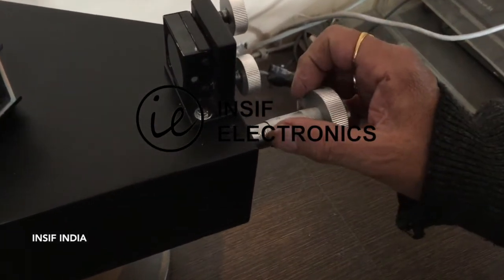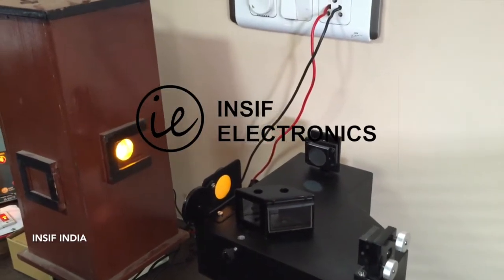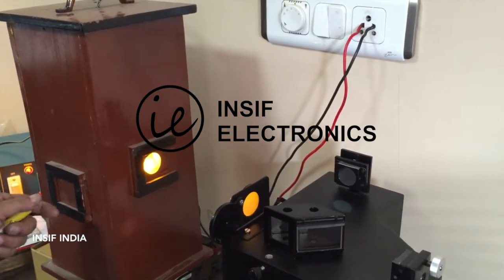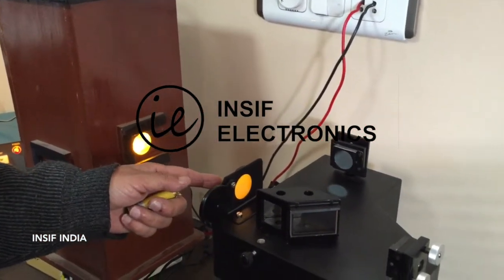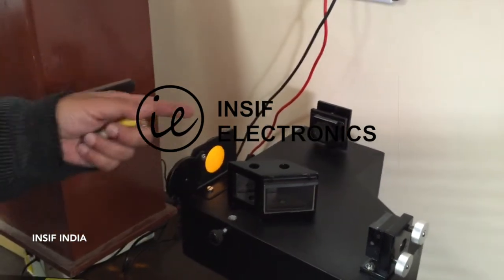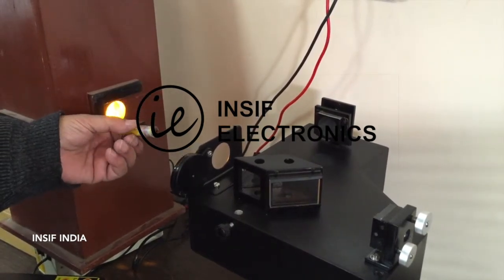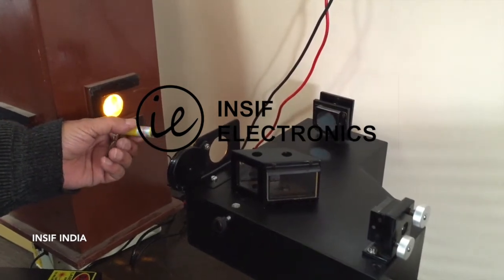The Michelson interferometer setup requires a sodium vapor lamp which, when switched on, faces the input side of the Michelson. There's a diffuser we have to remove to one side, and with the help of this toy laser pointer we will set up the main mirrors of the interferometer.